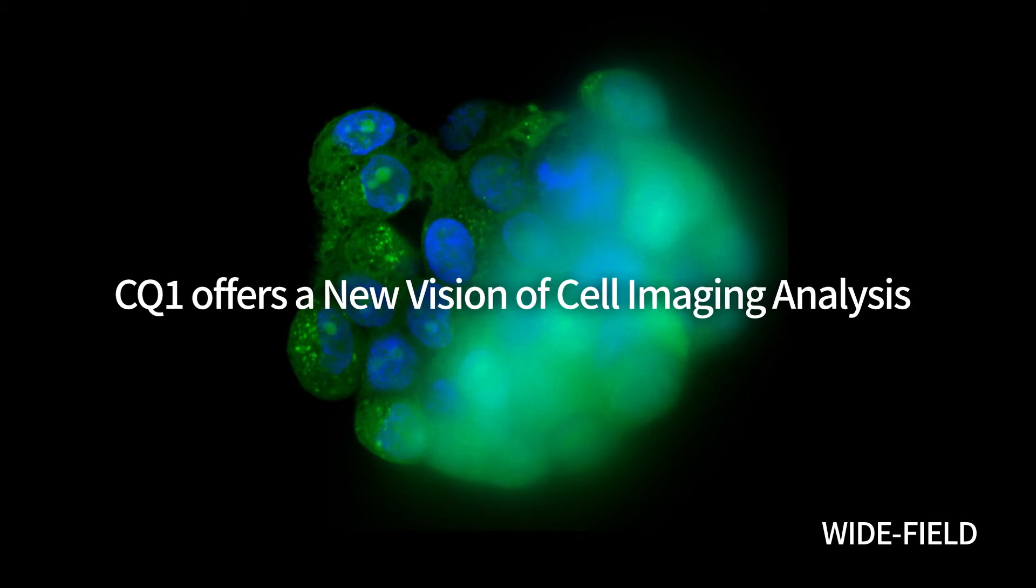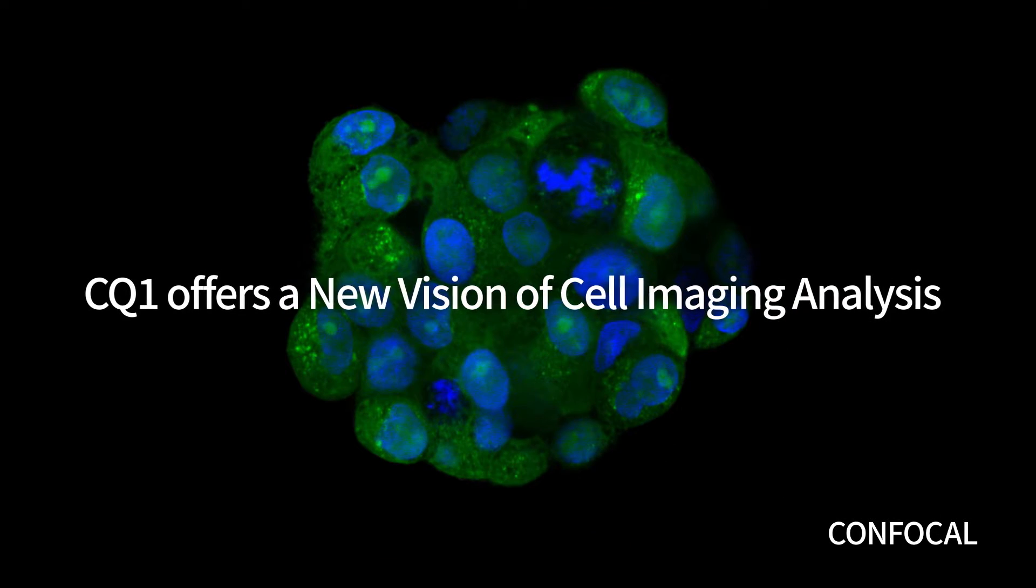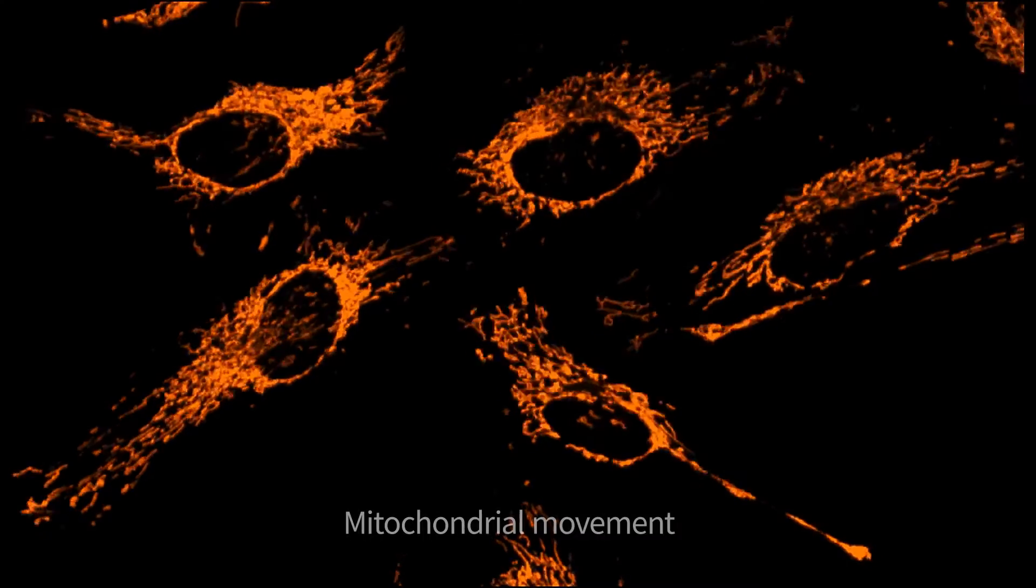It can be used for a variety of applications including time-lapse imaging of living cells.